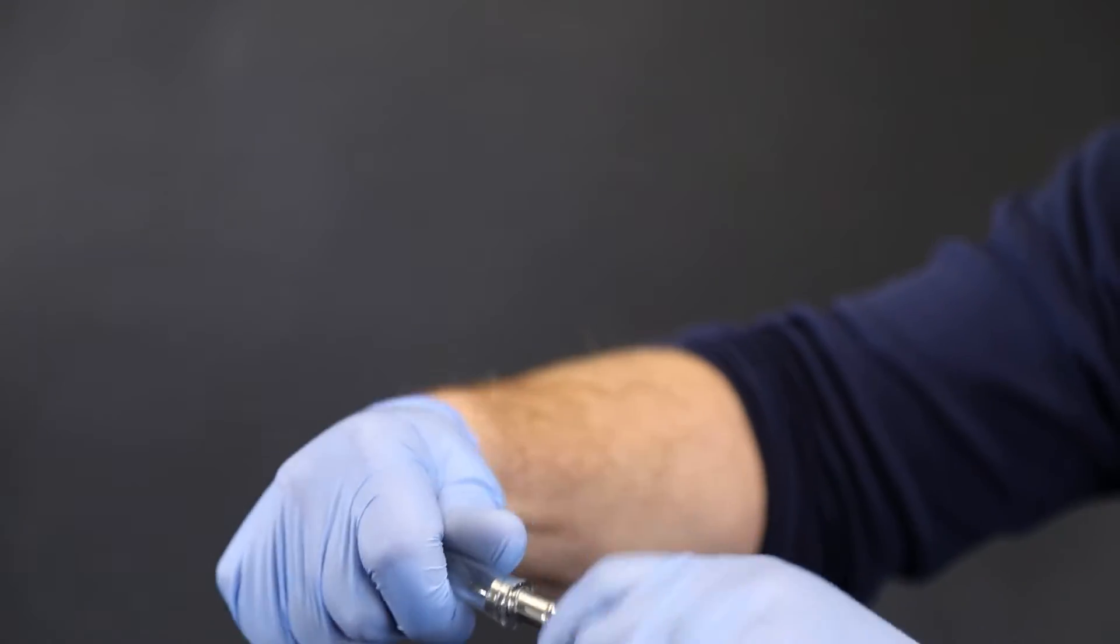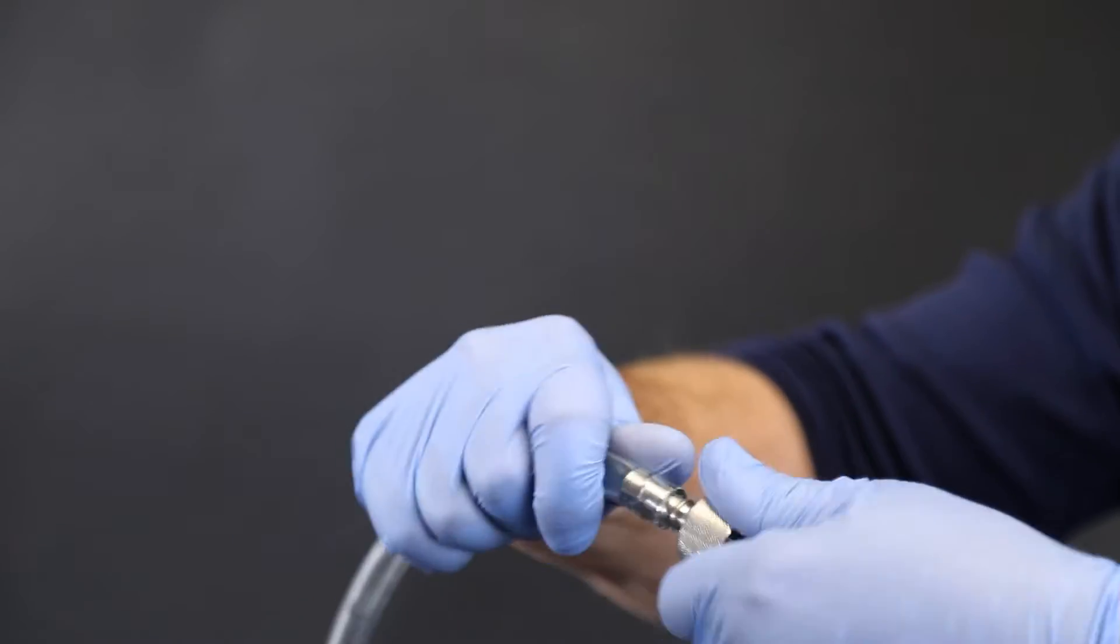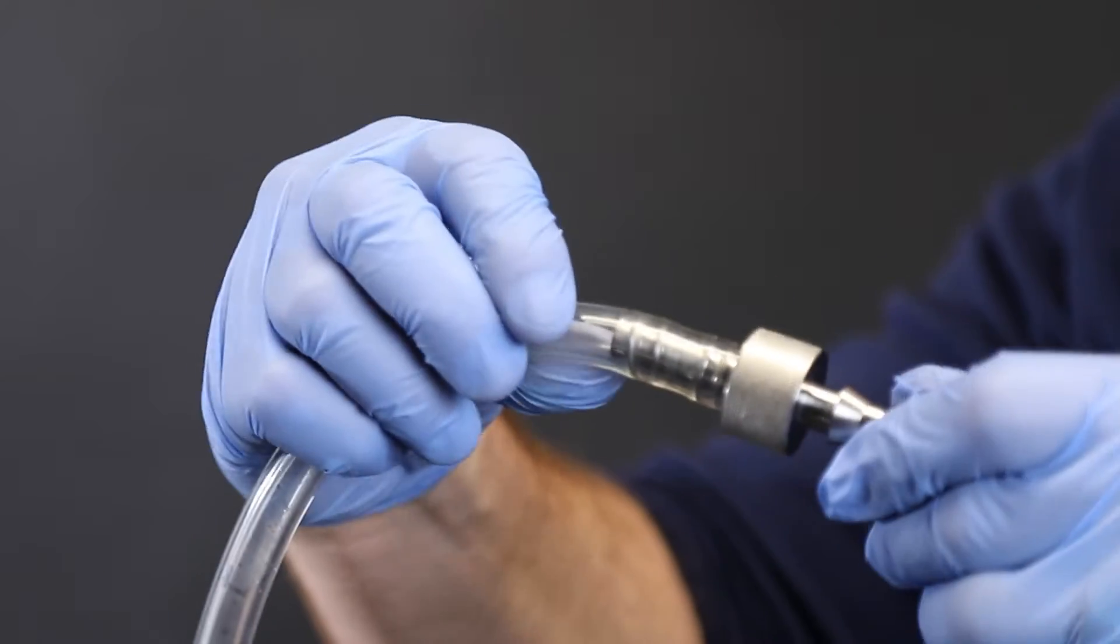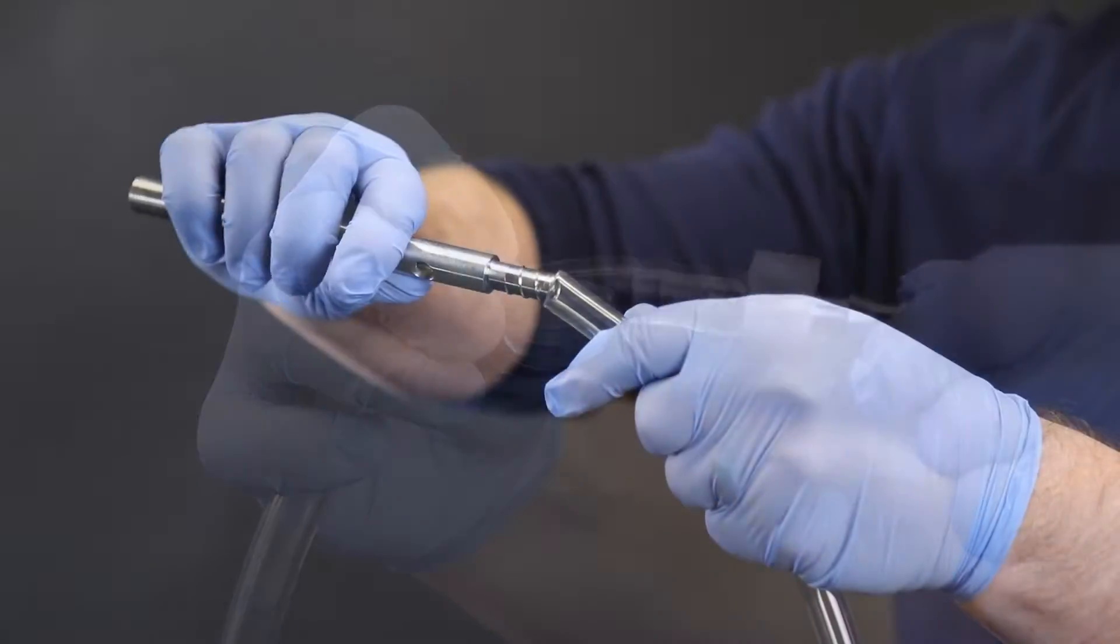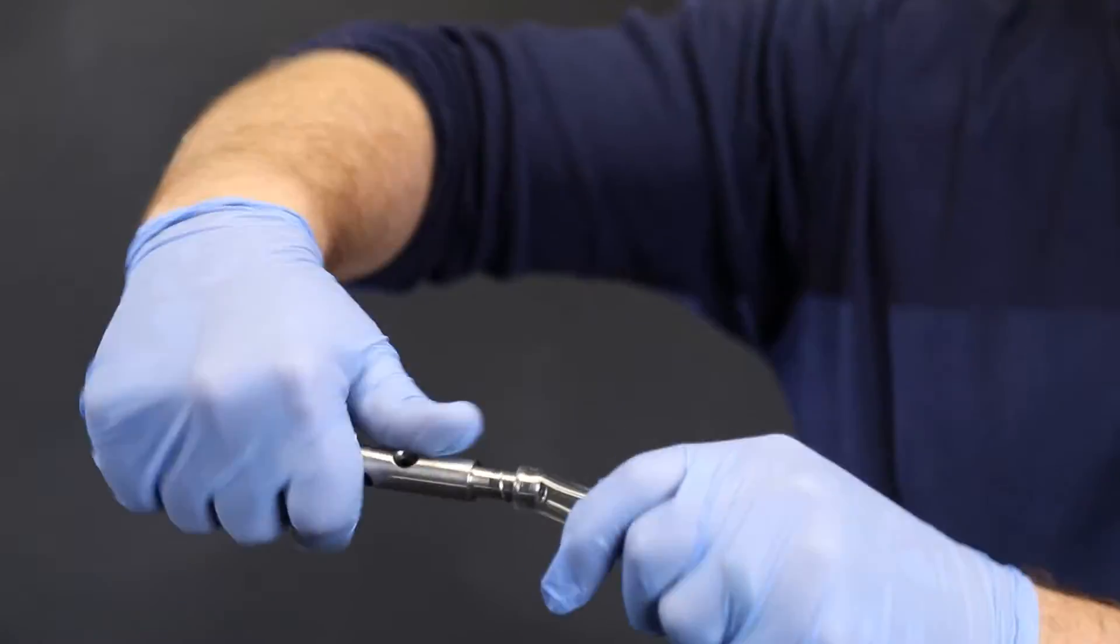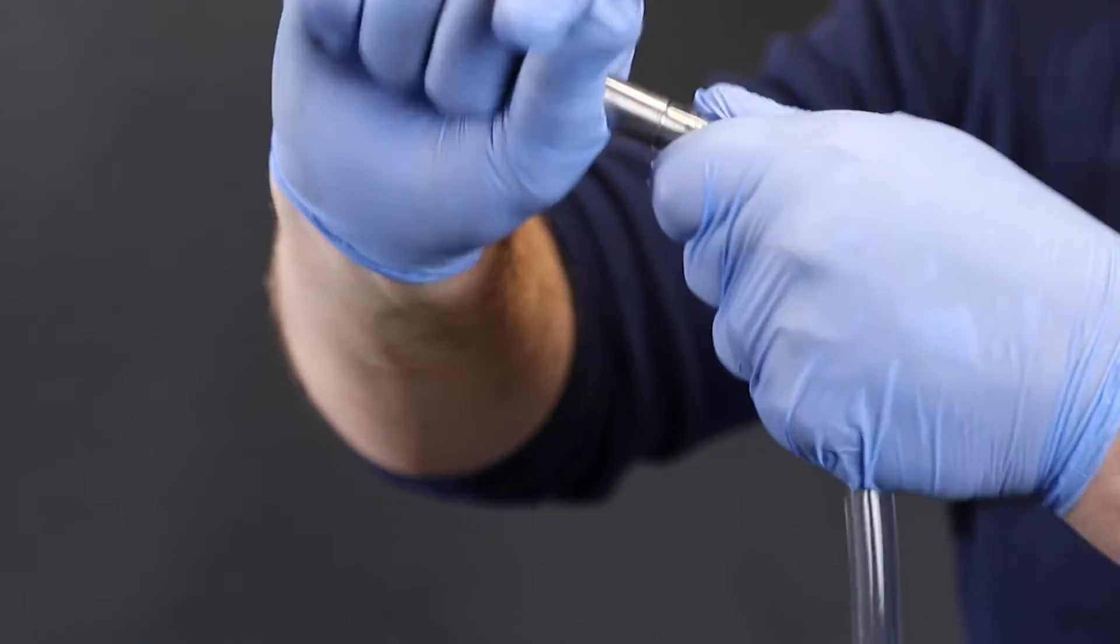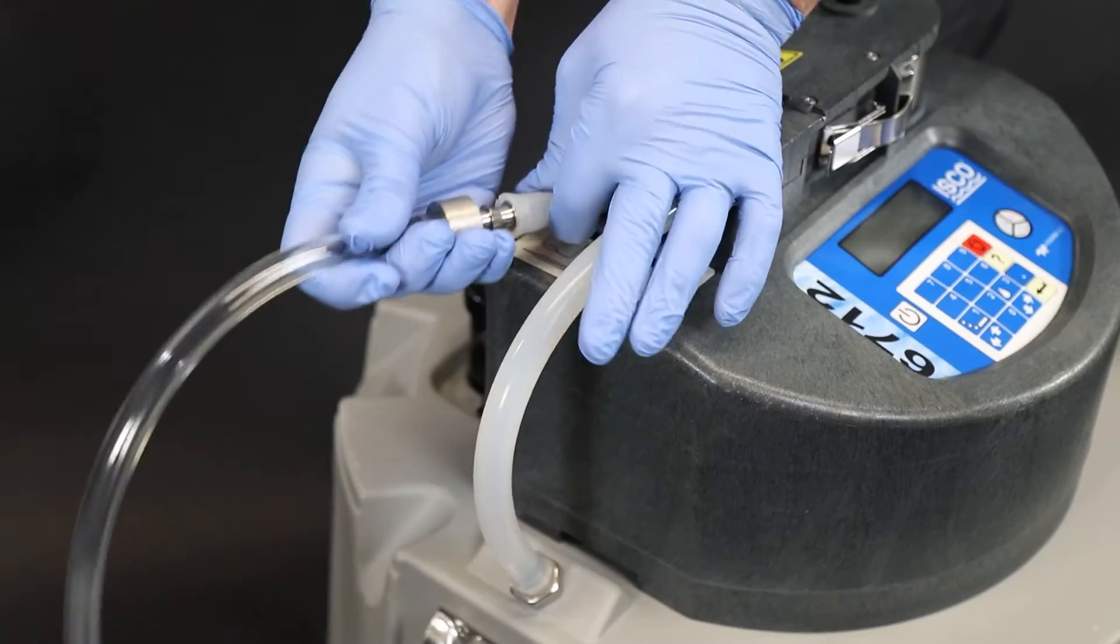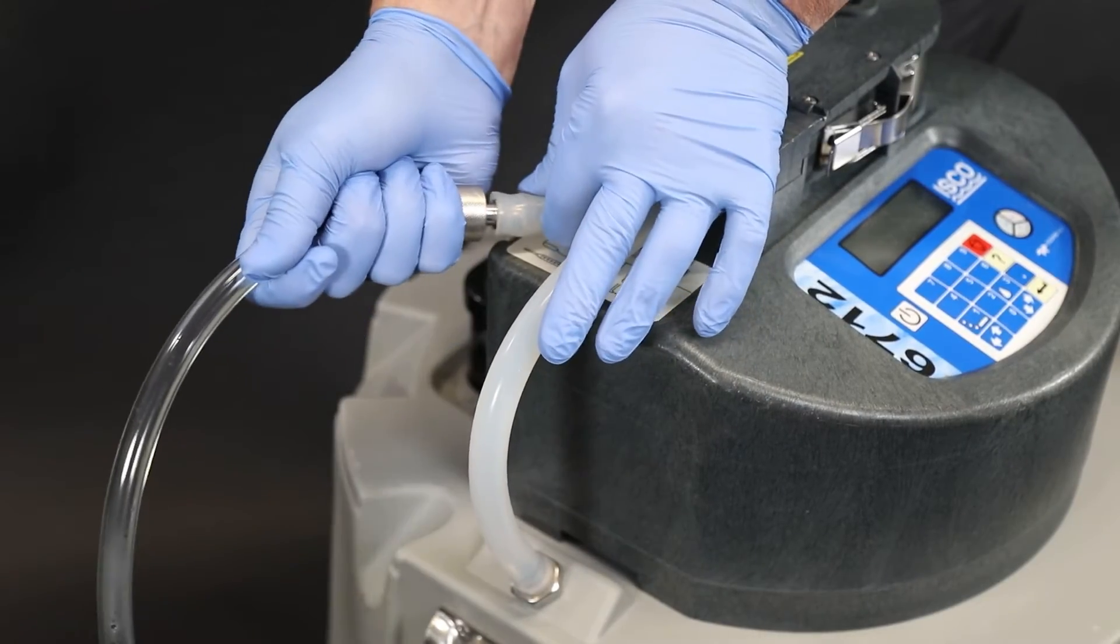To prepare the suction line, first screw a 3/8 inch tube coupling into the suction line tubing. On the other end of the tubing, screw in the low flow strainer.